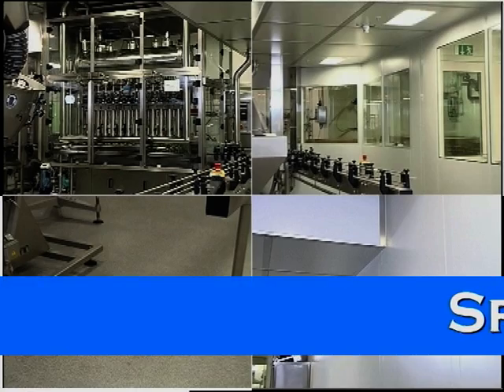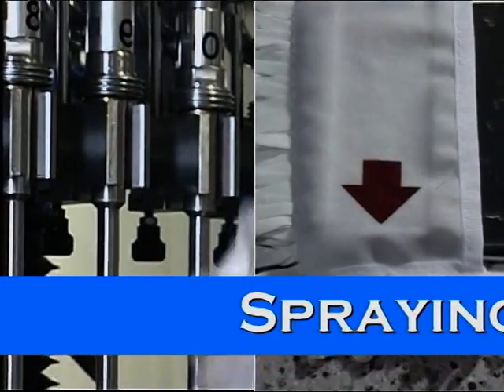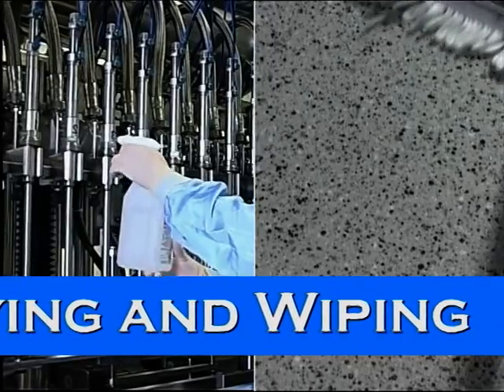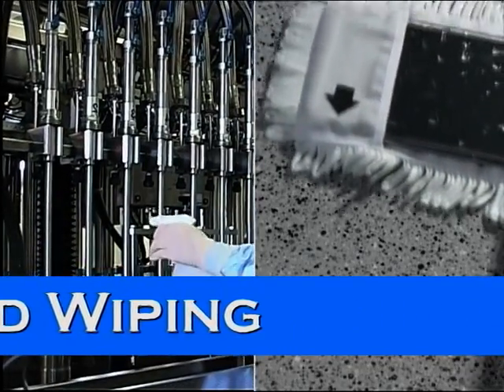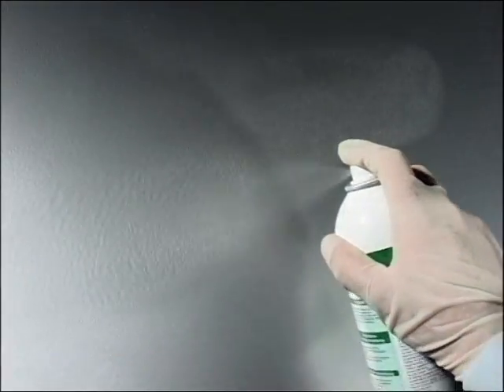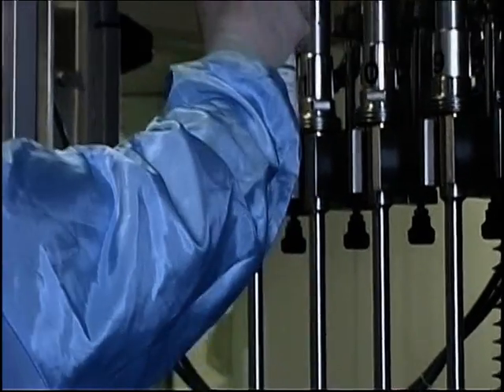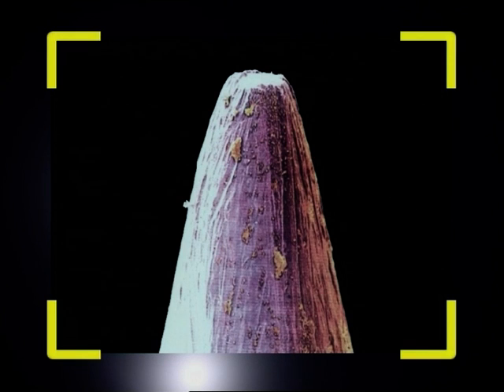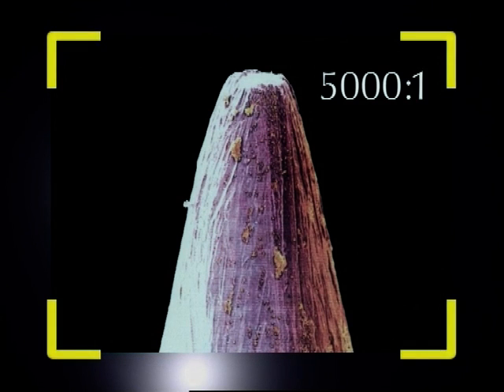Two different methods are used for cleaning and disinfection: spraying and wiping. Both must be carried out with the highest possible care, without any gaps and systematically, because every spot that hasn't been reached could ruin the whole cleaning process, since bacteria, for example, may be left behind. And leaving microorganisms or particles behind may lead to, what was that word again? Contamination. Just remember that.